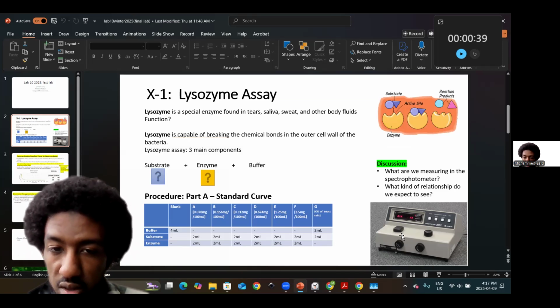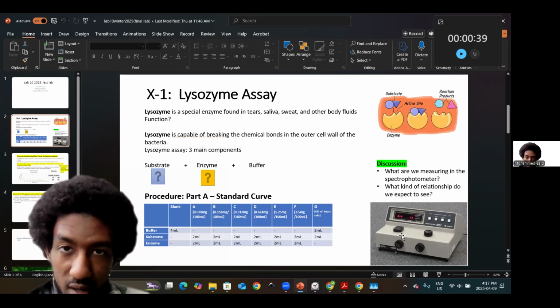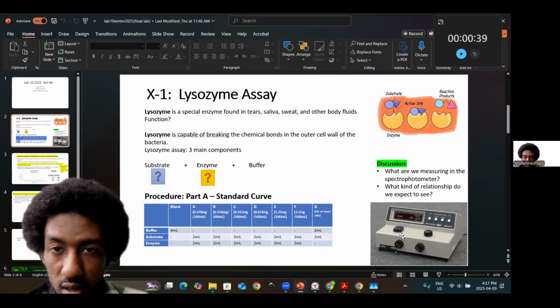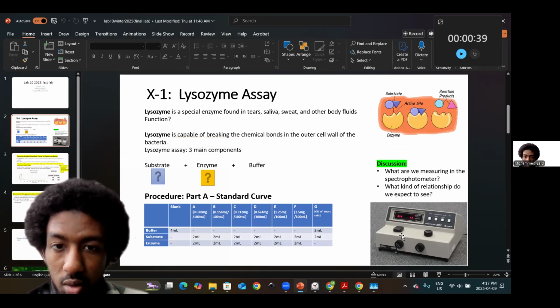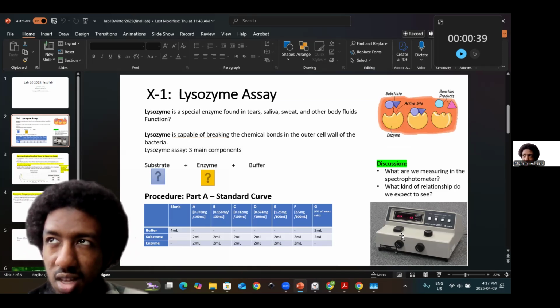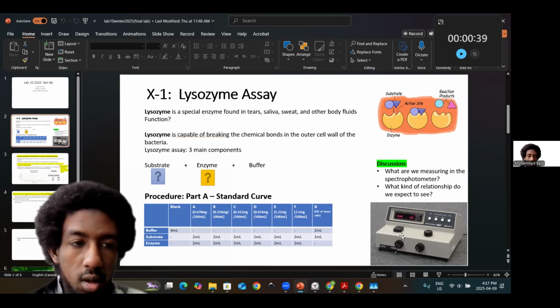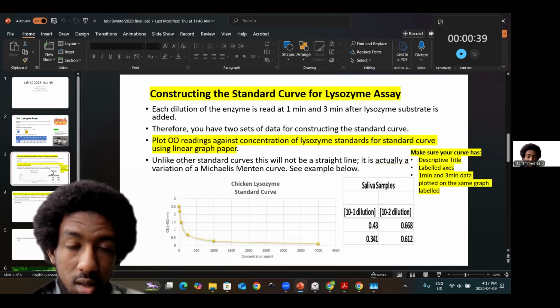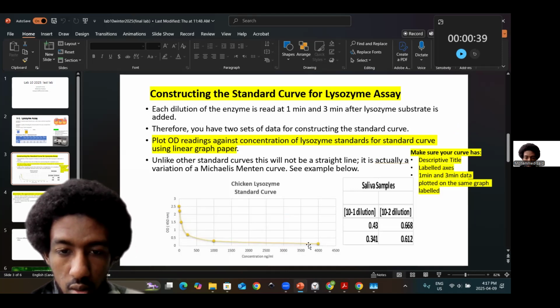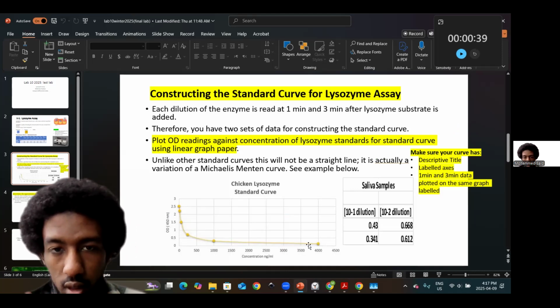So if you're increasing the concentration of the lysozyme that breaks down bacteria, then you expect the turbidity to go down, or even viable counts if you were to take them after a set of serial dilutions, perhaps. You would essentially assume a lysis of bacteria, and thus a decrease in turbidity over increasing concentrations of your lysozyme.